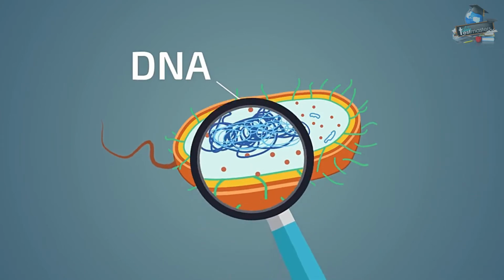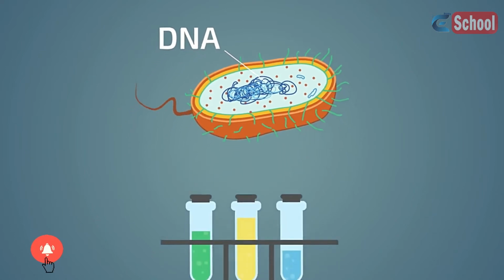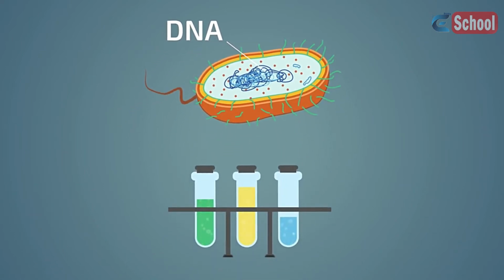Do you want to see what DNA looks like? Well, it is possible. You just need to extract it from some cells. You can do this in the lab or even in your own kitchen. The easiest way to do this is to use some fruit. In this video we will go through the steps to show you how.